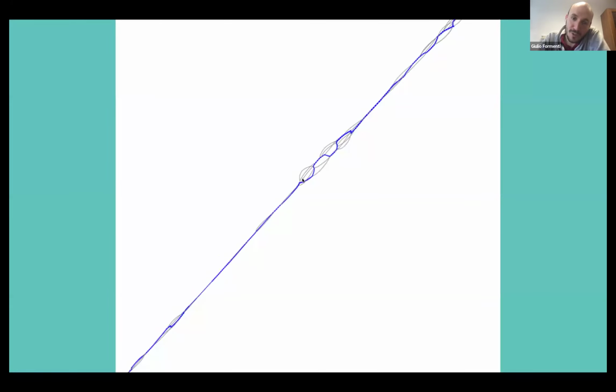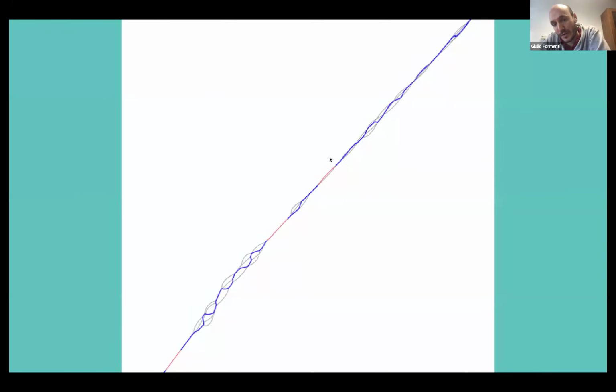This is a bit more zoomed in view. I find it kind of fascinating that you can see this web of potential alternative paths in the graph that are made visible with this tool. And there we go again. Oh, here we have two errors. In one case, you can see there is an alternative path that would potentially fix the error. Here, it looks like we don't have an alternative path in the reads either.